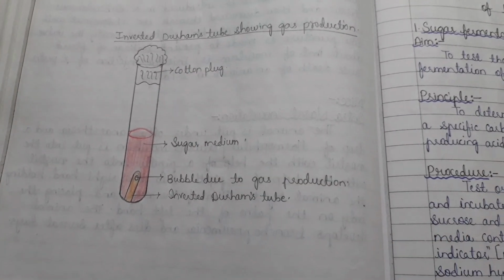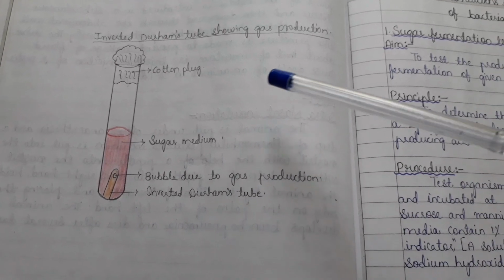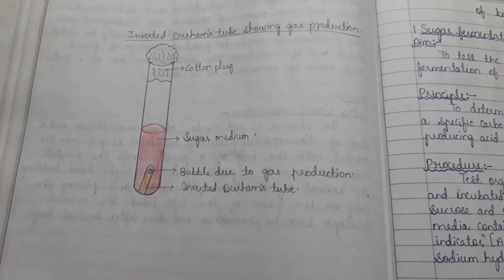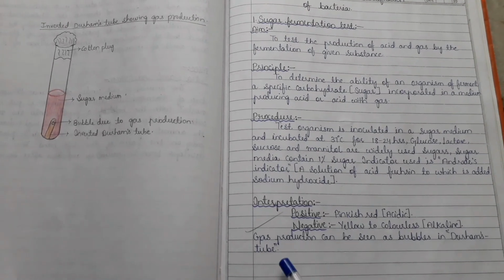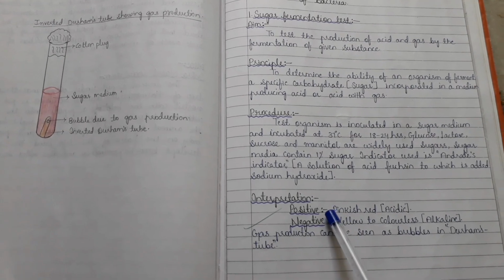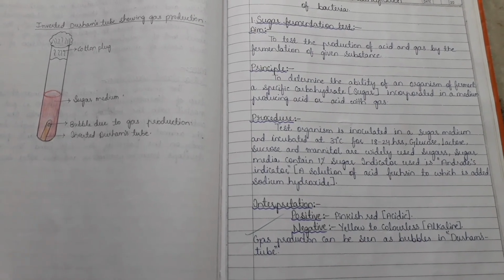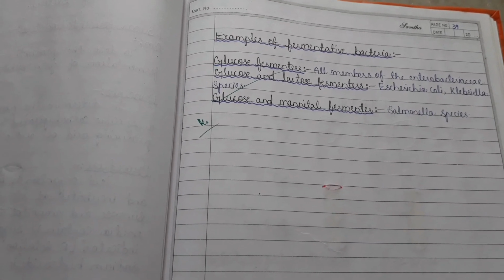Inverted Durham's tube showing gas production. Yeah, this is a picture of the sugar fermentation test, using the Durham's tube method. So the positive test shows pinkish red color, whereas negative is yellow to colorless. So these are the examples of fermentative bacteria.